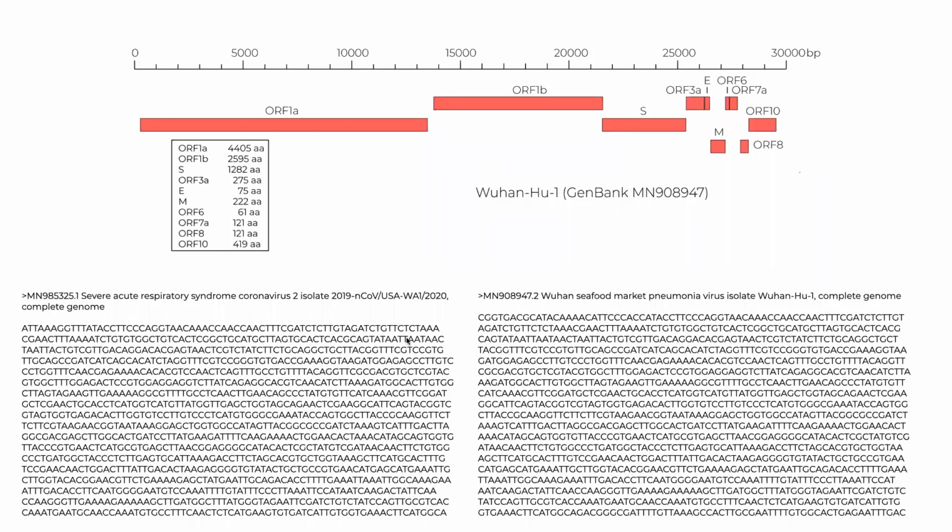So here you can see what the sequences look like, right? You can see that these are actually FASTA files, right? The previous reads that we saw were called FASTQ files, typically as an output from a next generation sequencer. But what we are looking at now is FASTA files, and the FASTA files really just contain the nucleotide sequence.